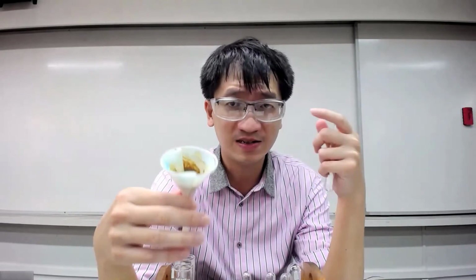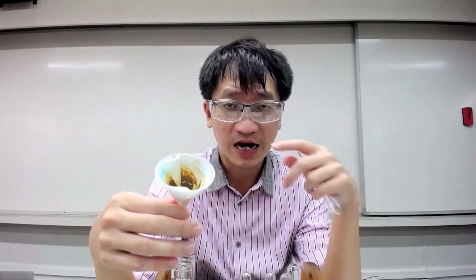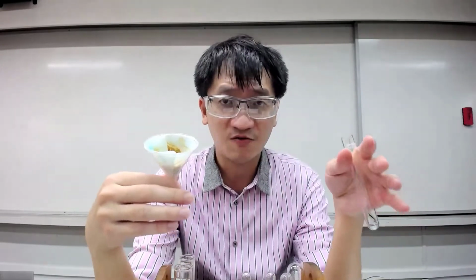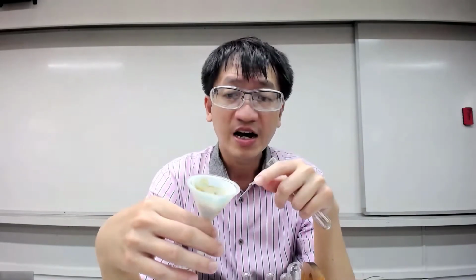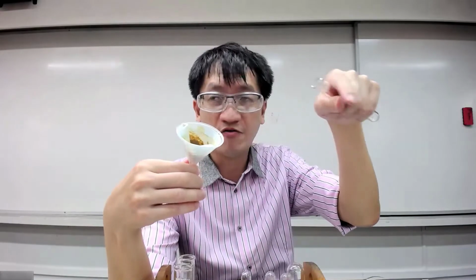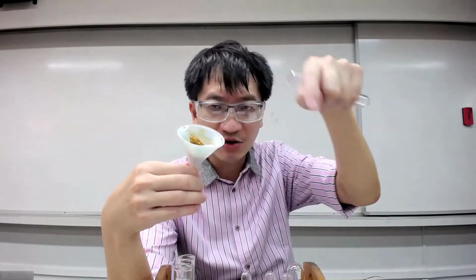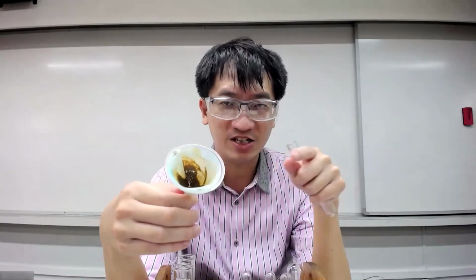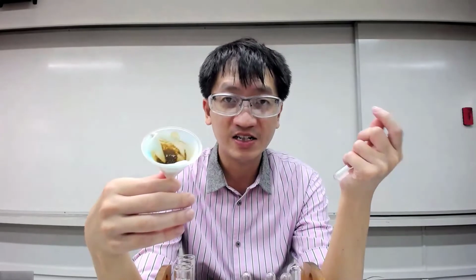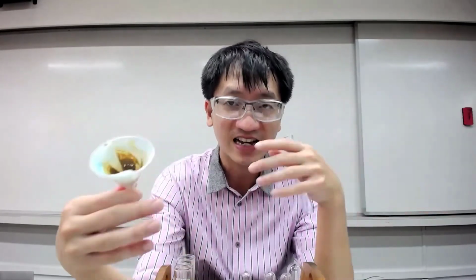But this is not the case, because if a green precipitate becomes brown as iron(II) hydroxide is oxidized to iron(III) hydroxide, it won't be so even. You will see brown patches at the rim of the green patches, so it won't be evenly oxidized. In this case, we can conclude that it's actually iron(III).